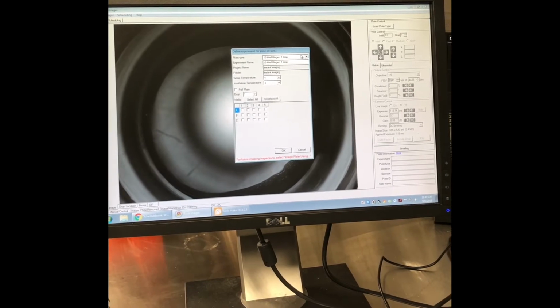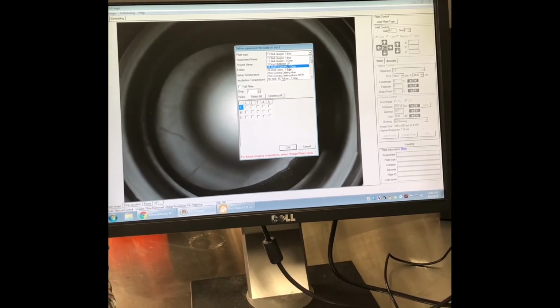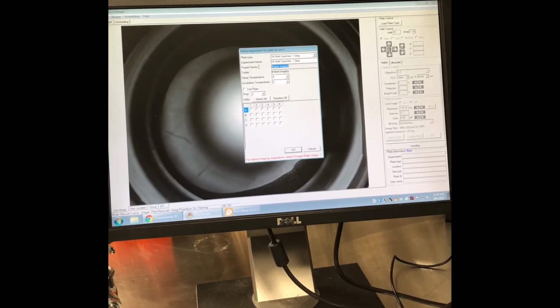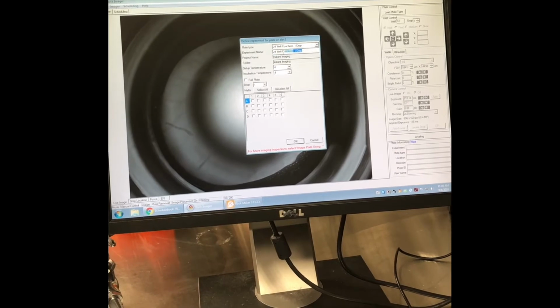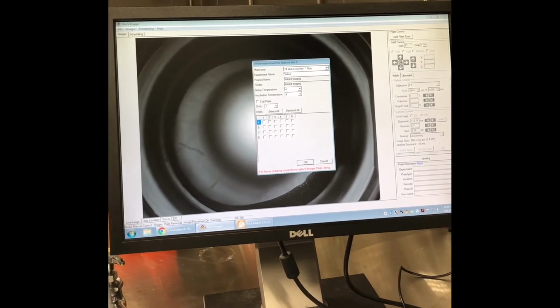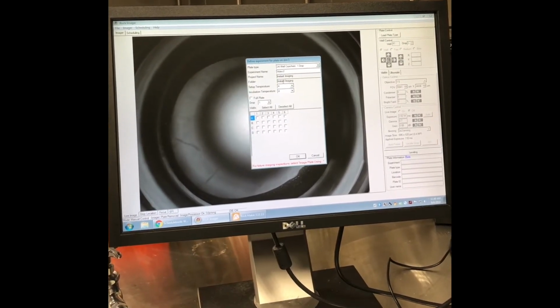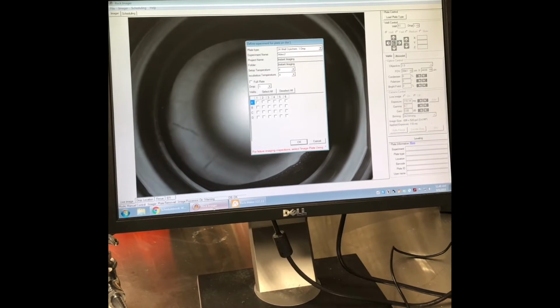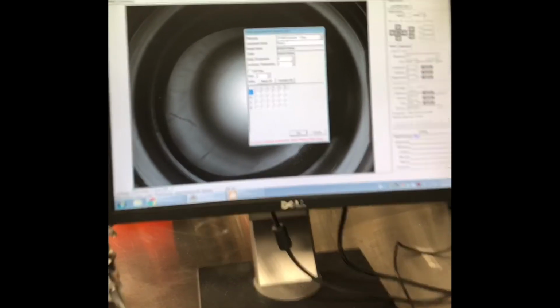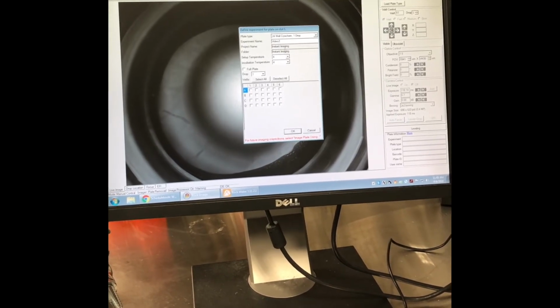Most important thing is the plate type. This one happens to be one of these 24-well plates here. Give it a name. And it's going to be in Project Folder Instant Imaging. Since you're logged into RockMaker as you, this will show up in your Instant Imaging folder.